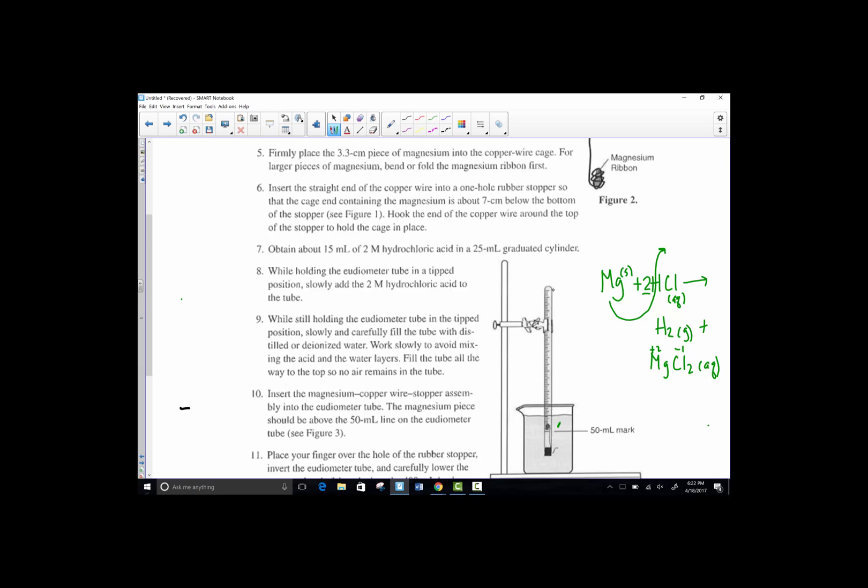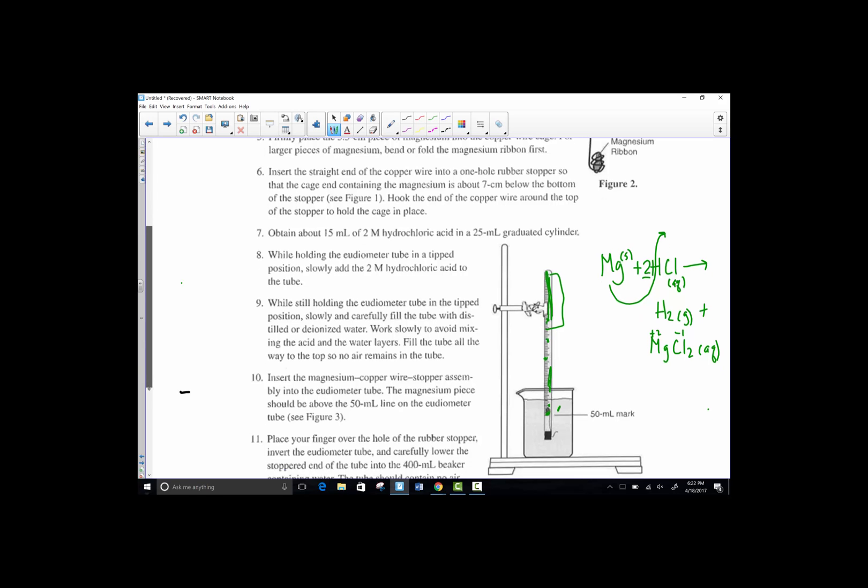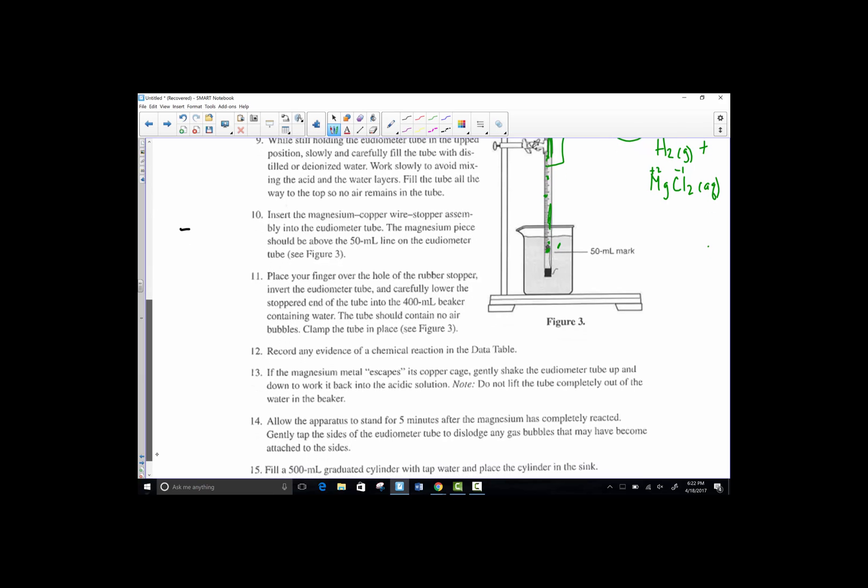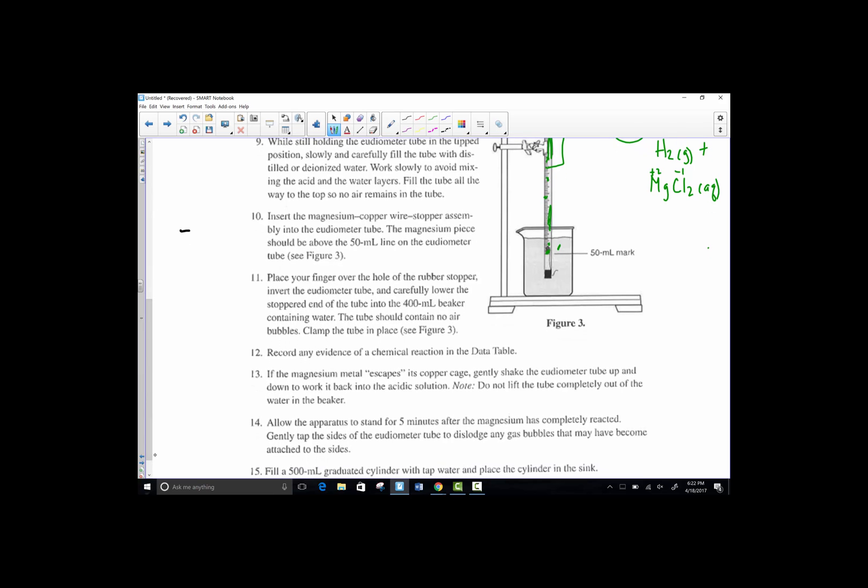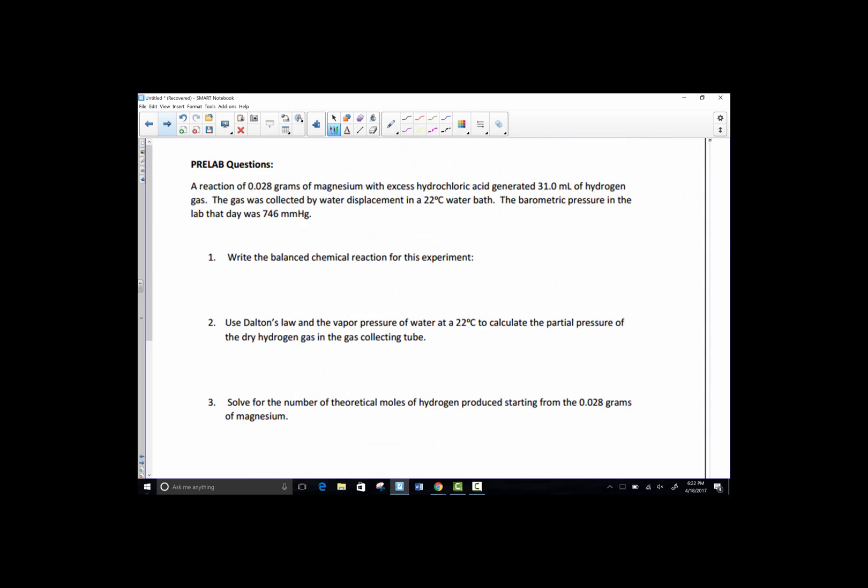So in the experiment, you know that when the acid falls and finally meets the magnesium, you'll see hydrogen gas bubble up. And you'll just start to see the gas collecting as a pocket of gas up top here. So that's kind of the general setup as you've read through in your procedure page. We're asked to process some pre-lab questions just to prep us for processing the very equation that you get from your own data.